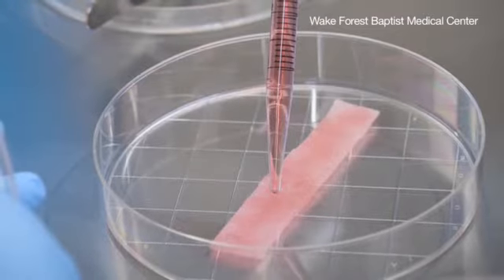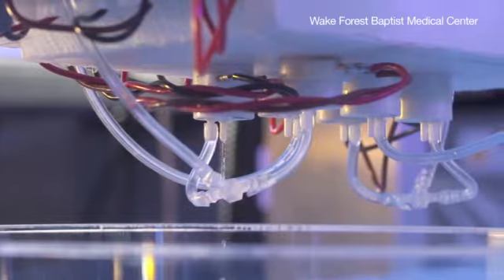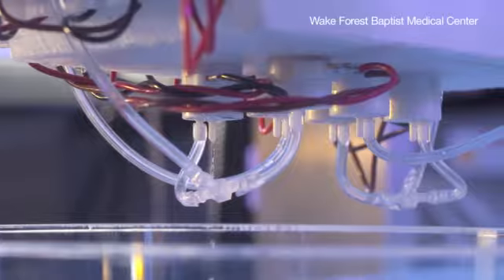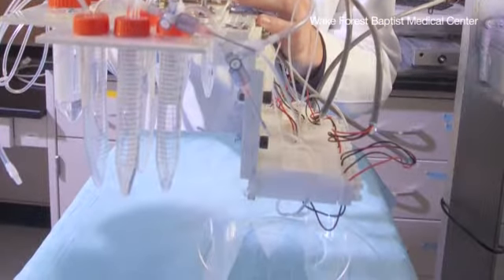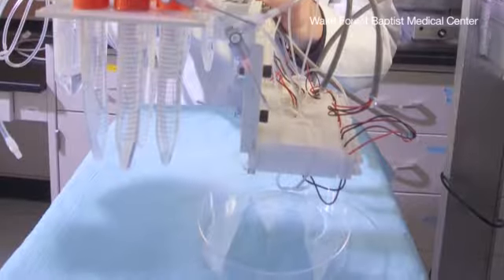We use many different strategies really to try to create solid organs, and one of them is actually to just create the organ one layer at a time. Another strategy is to actually take a donor organ that we take the cells out of and we can repopulate it with the patient's own cells. And another strategy is actually to just print the organ. And that's actually what we show today, is how can we actually use printers that will print these organs one layer at a time. All of these technologies actually involve using the patient's own cells.